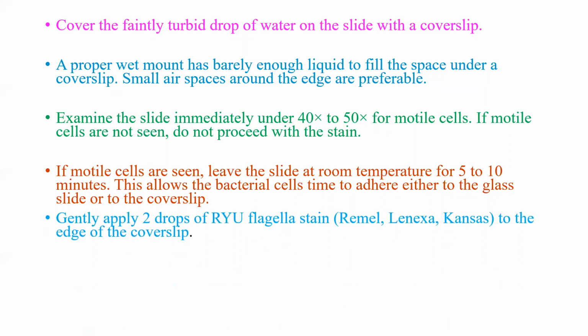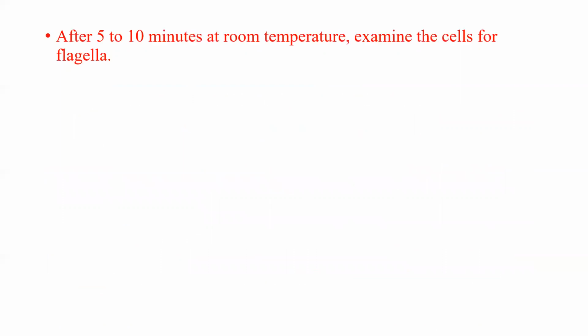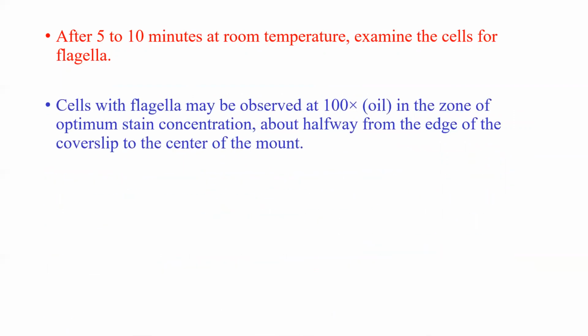Gently apply 2 drops of RYU flagella stain, that is Remel, Lenexa, Kansas, to the edge of the cover slip. The stain will follow by capillary action and mix with the cell suspension. Small air pockets around the edge of the wet mount are useful in aiding the capillary action. So after 5 to 10 minutes at room temperature, examine the cells for flagella.